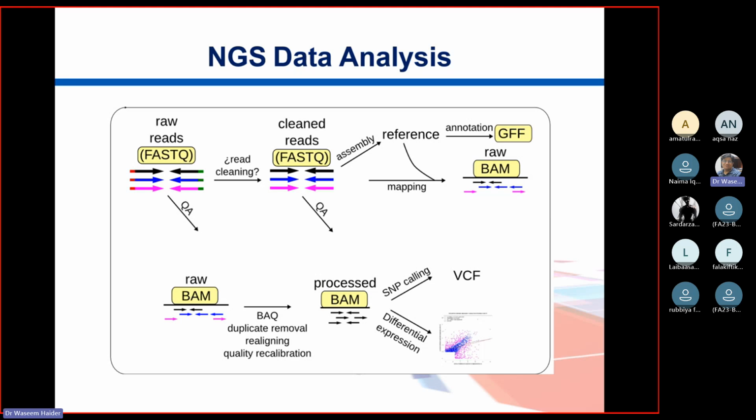A reference. So you take those clean reads, and then you put them together, and this process is called assembly.